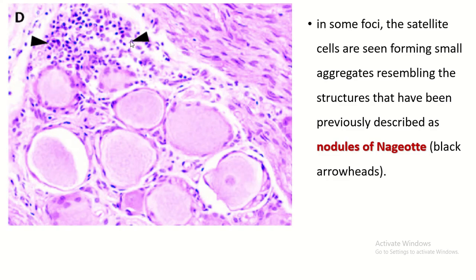This is known as the nodule of Nageotte. It is formed by the aggregation of satellite cells, sometimes found in the cross-sections of the dorsal root ganglia.